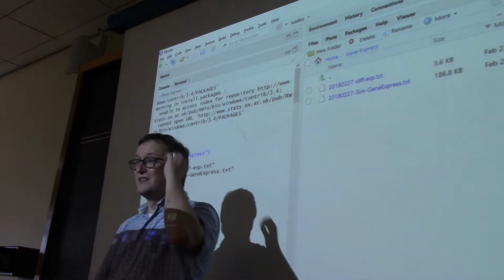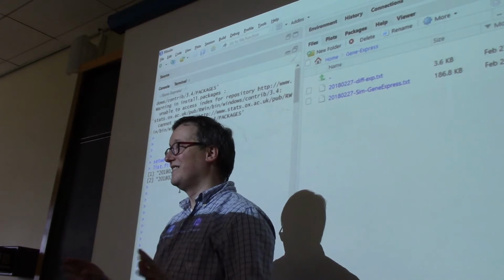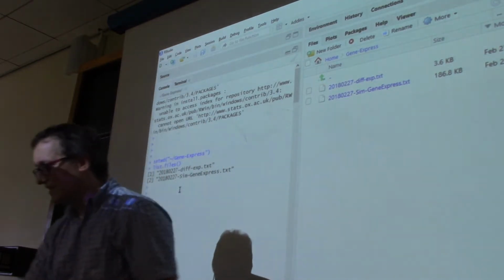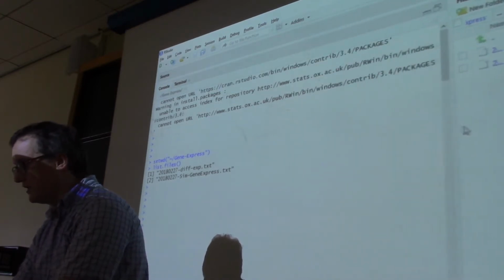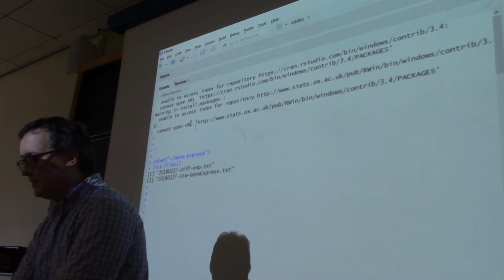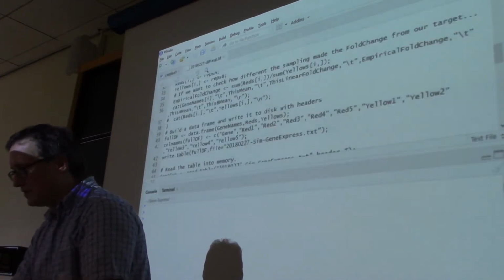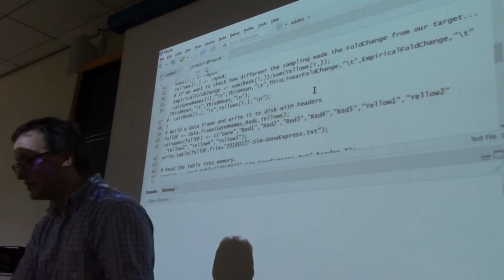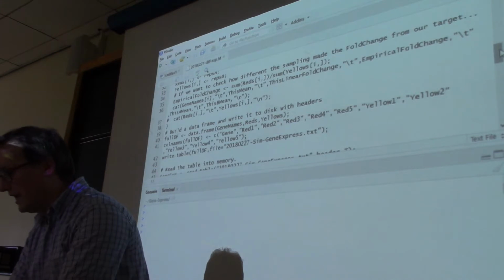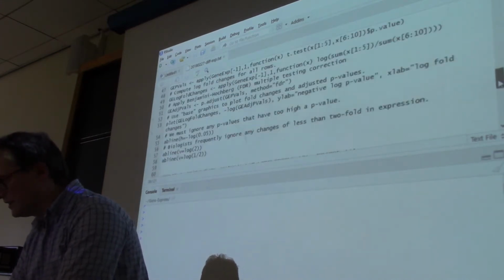Great. Okay. So, any other questions before we move ahead? All right. Now, I'm going to move this bar over to the right because I have rather little screen to work with here. You have your full width of screen. So I'm going to put the differential expression text file at the top, and have my console down at the bottom. Oh my goodness, this is just vexing me. Okay.